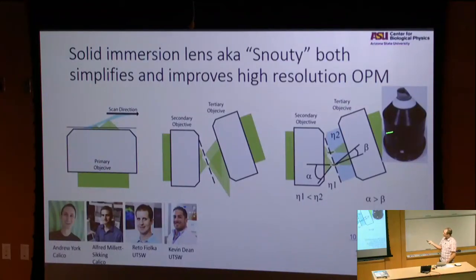What you sacrifice is you have more and more glass in these systems, right? So you keep all of the high frequency information, but you sacrifice photons. But what this means is we can re-image diffraction limited emitters with the exact same spatial resolution that we could if we just had the native microscope, but we can do it in 3D now.